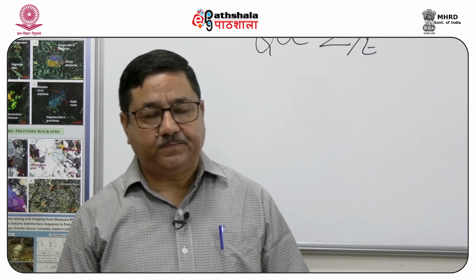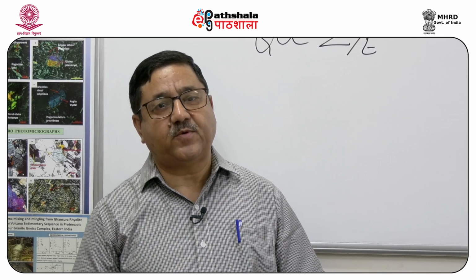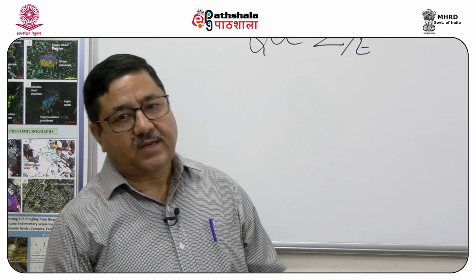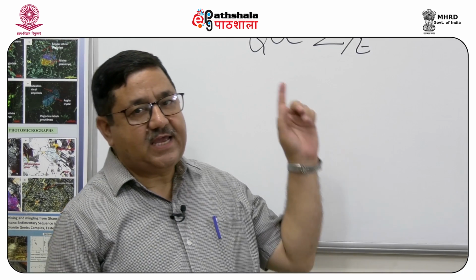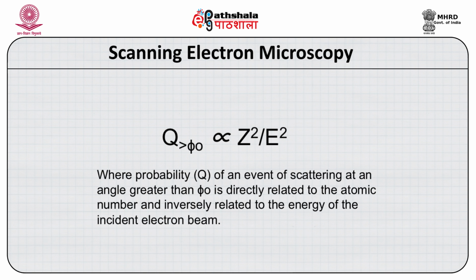So, therefore, the interaction of the electron beam with matter can be best described as a probabilistic event. So, the probability of an elastic scattering is expressed in these forms, where E is the energy, Z is the atomic number of the material with which the electron beam is interacting, and Q refers to the probability of an event occurring.